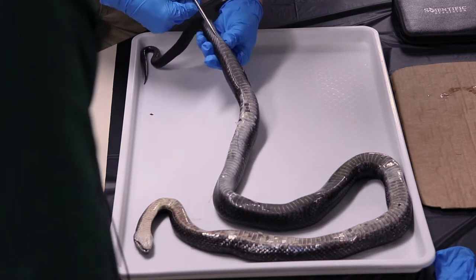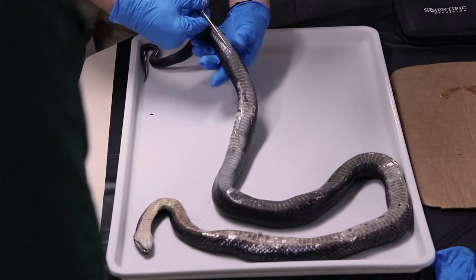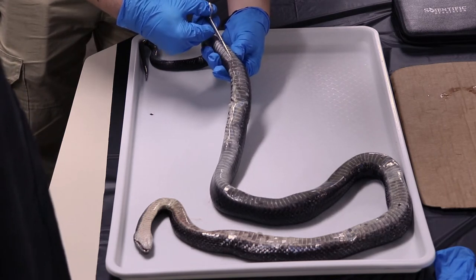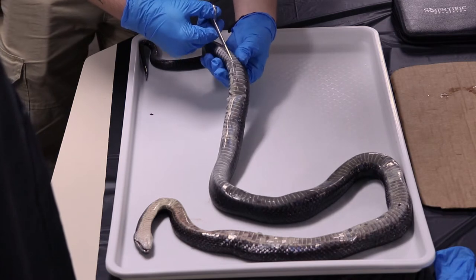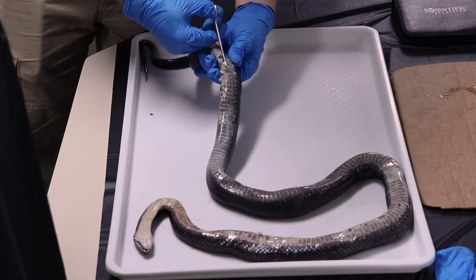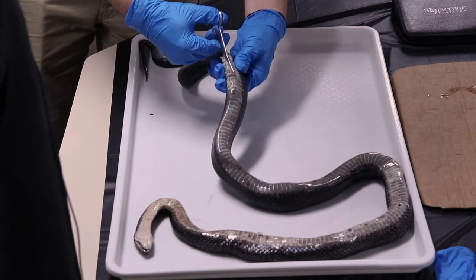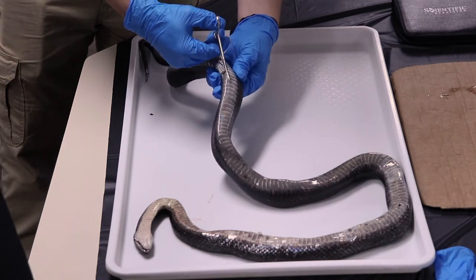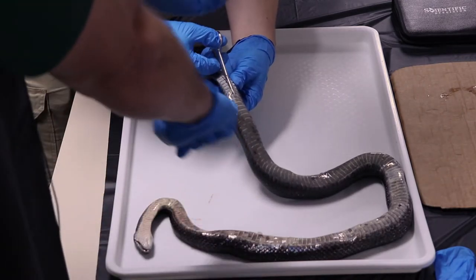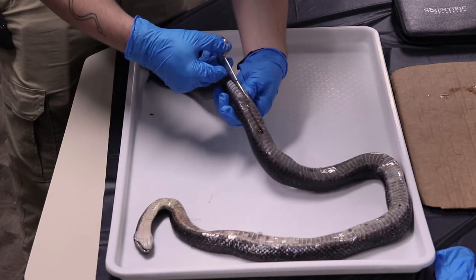Do snakes have skin separate from their scales, Lance, or are their scales their skin? Is this a trick question? No. Genuinely asking for the folks at home. I've never really thought about it, but their scales are on their skin. I've always thought of scales as modified hair. Or hair is modified scales. So I would say their skin is separate, but their scales are attached to their skin. And they might have dermal layers similar to what we mammals have. Yes, so their scales may only be the epidermis, because if you stretch out the scales, you can see skin in between each scale.